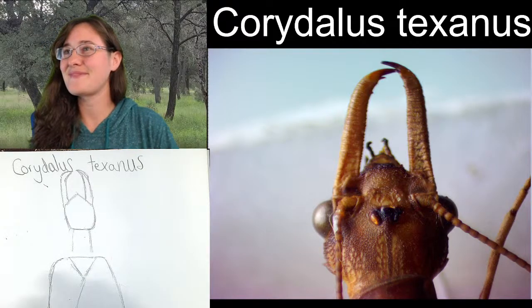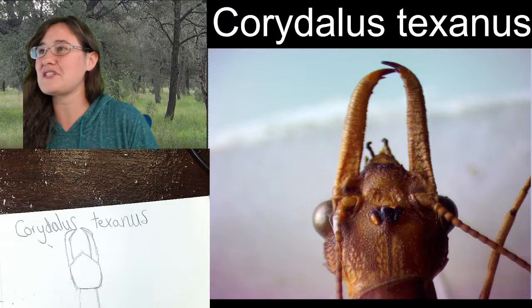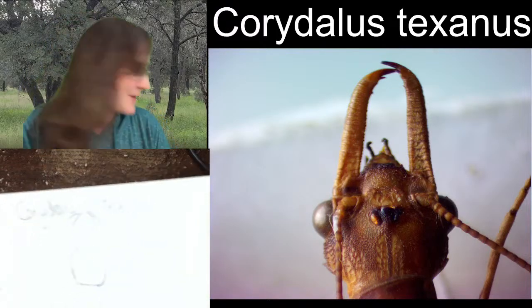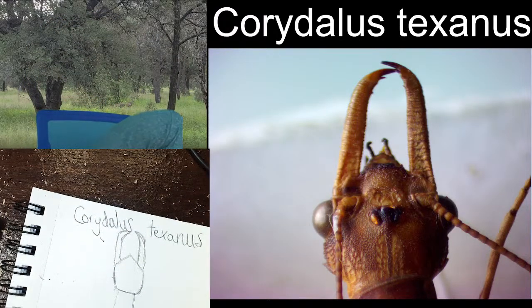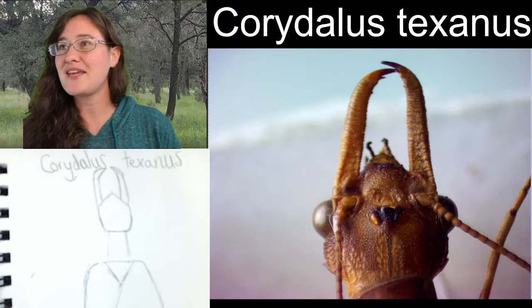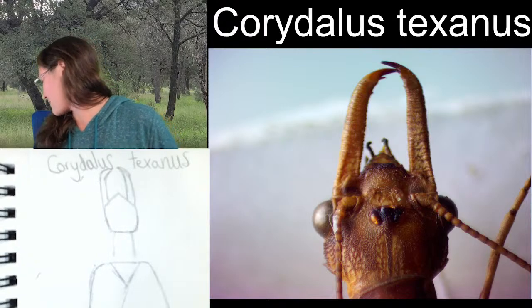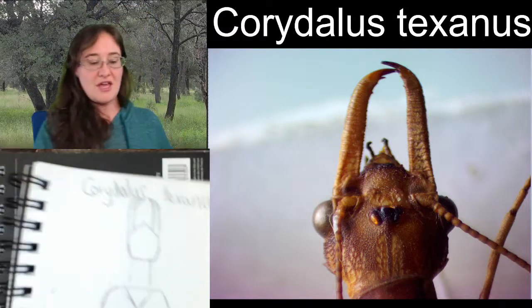Alright, so let's check out that head. I love these mandibles. And I'm trying to get my sketch just a little bit taller for you guys. Gotta pick a better book. This book. That'll be tall enough.